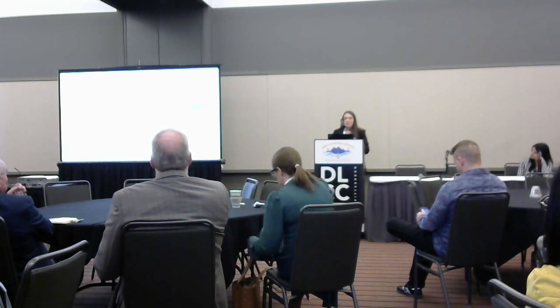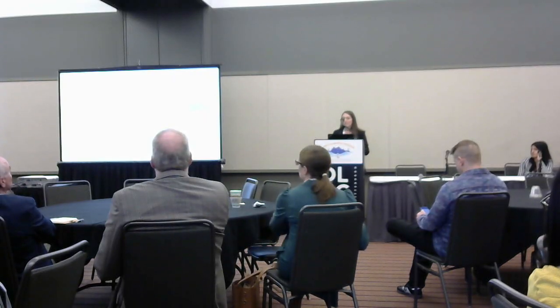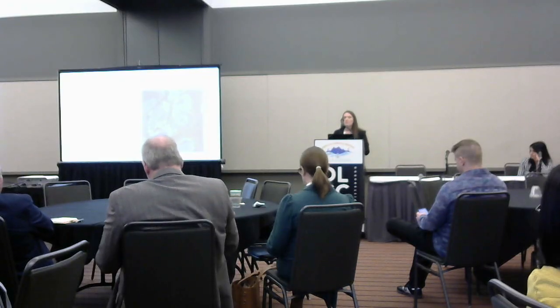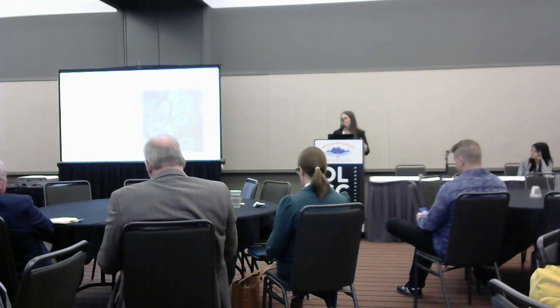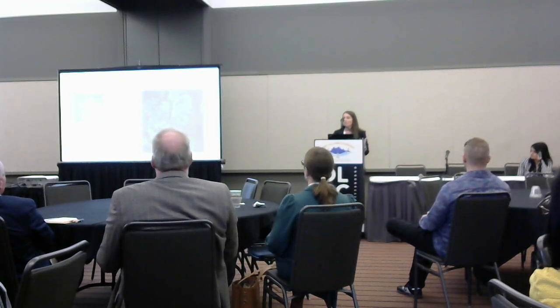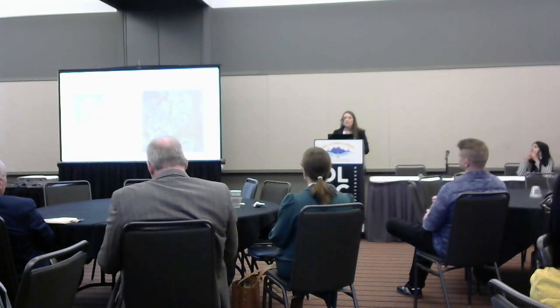So big picture here, the image analysis process is iterative. The next aspect is that images are really complex numerical data. So when we look at an image zoomed really far in, we see that it is just an array of numbers. And these numbers have lots of components.